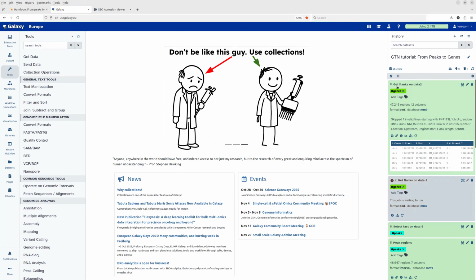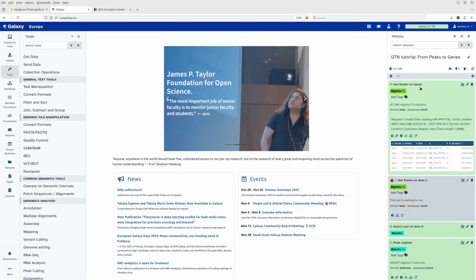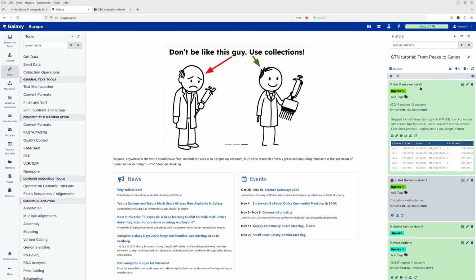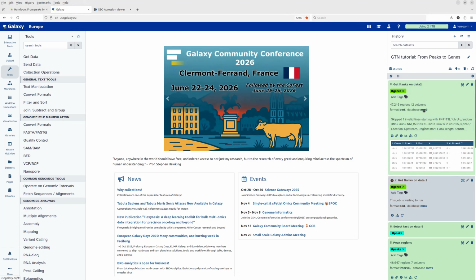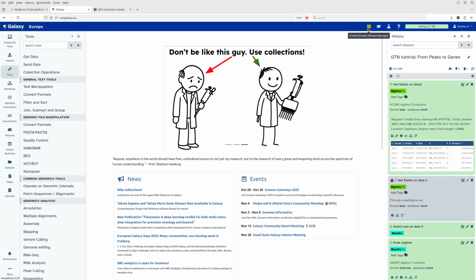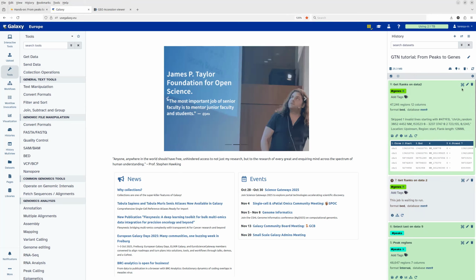So your output file is now called get flanks on data 2, as we had as input the genes file, which we created in the second step of today's tutorial. And you see that we have the BED format and the MM9, and to check whether what we did was really working, we can now again open the data 2, so our genes file, and the newly generated one, and compare the start positions that we have.